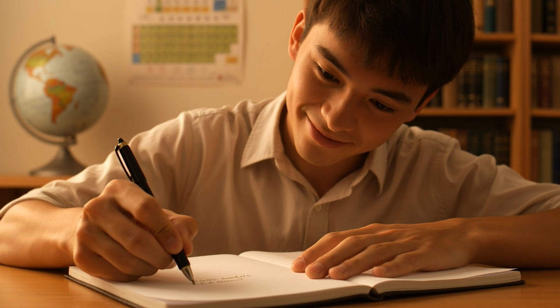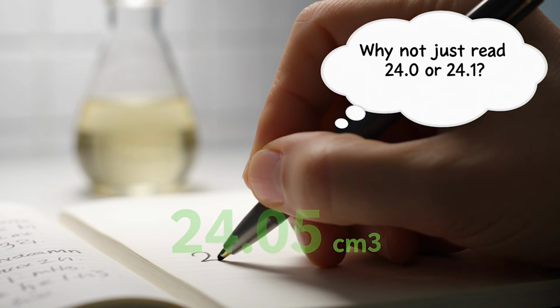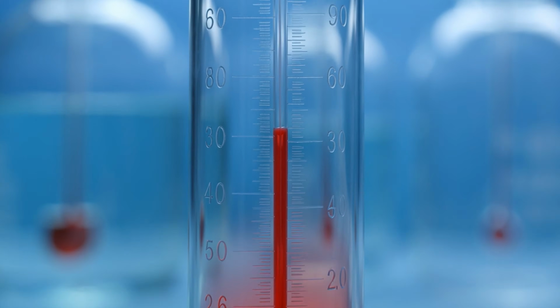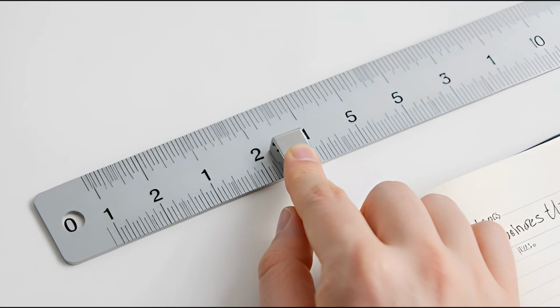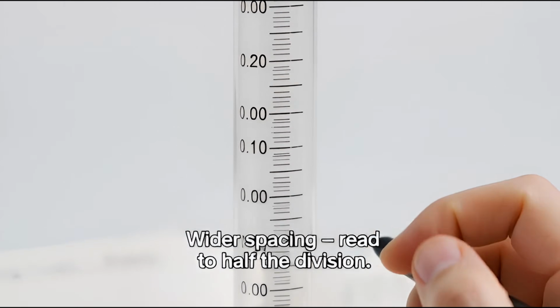Check before you draw. Burette lines every 0.10 cm3, read to the nearest 0.05 cm3. Always estimate the half. Thermometer marked every 1 degree, read to the nearest half degree, 24.5, not 24 or 25. Tightly grouped marks, read to the nearest line. Wide spacing, use half divisions.